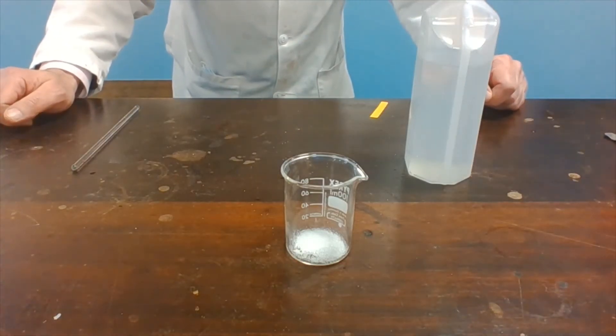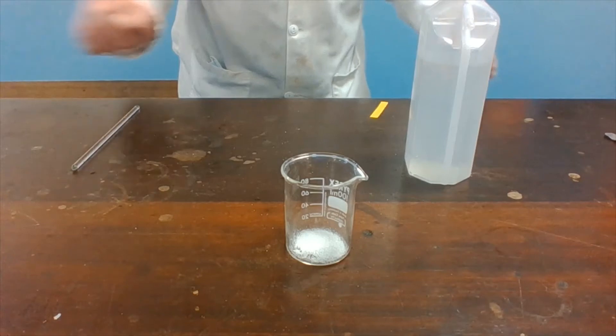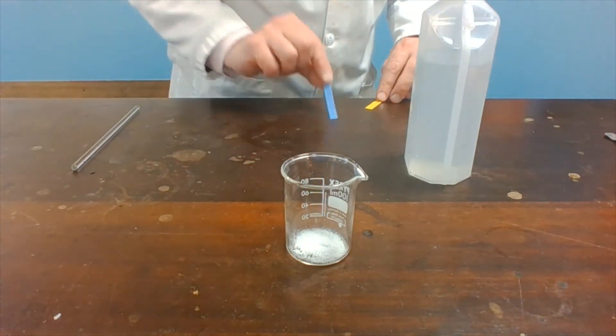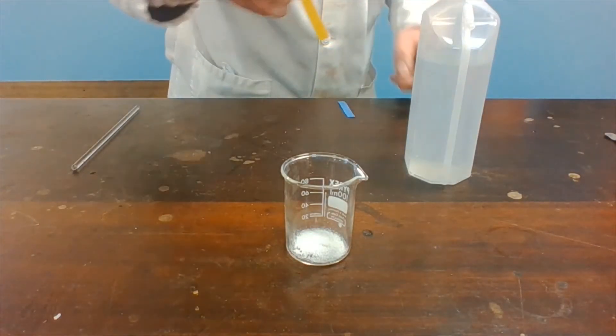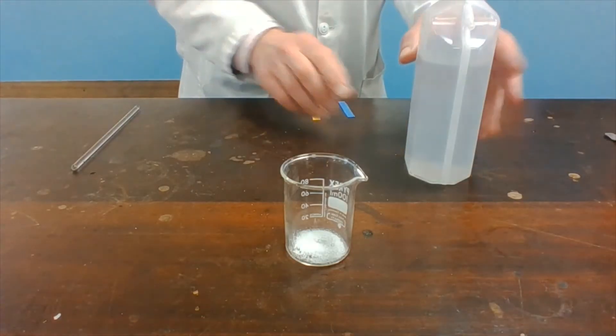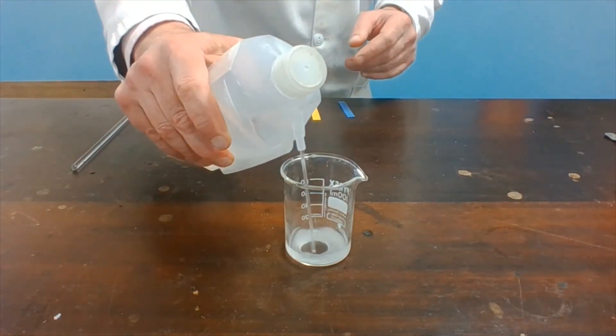At the end of the last video, I forgot to show you that the citric acid solution does, in fact, affect indicators. Remember, the solid citric acid has no effect on the litmus paper or the universal indicator paper. If I dissolve the citric acid solid in water.